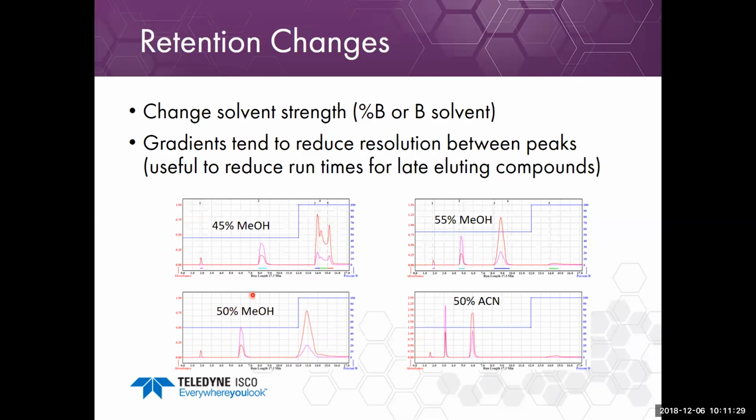I can reduce the retention time by another factor of 0.75 by going to 55% methanol. And I trust that you could see a pattern here. For these isocratic runs, if I increase the percent B by about 5%, the retention time is changed by about 75% as a rough approximation. So 8 times 0.75 gives us 6 minutes, and then another 0.75 gives me 4.5 minutes.